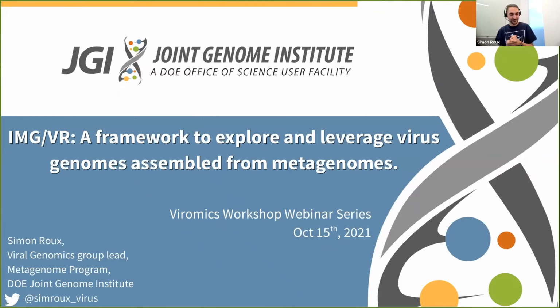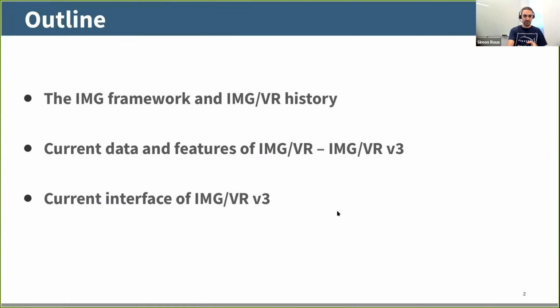Hi again, everyone. After Wednesday's talks today, talking about databases, and after Joanne's great introduction, I think this will work perfectly. So let's get in, and I will talk really specifically about IMGVR.